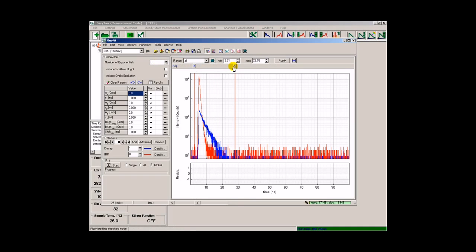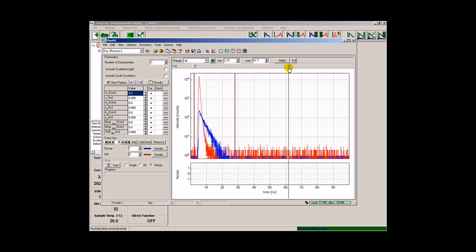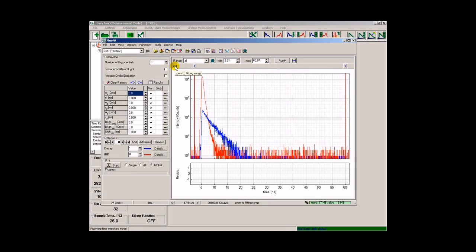We can use the vertical bars to select the fitting range and then use the globe icon to apply this fitting range to the whole dataset. By pressing the zoom button, Fluofit automatically zooms into the selected data range.